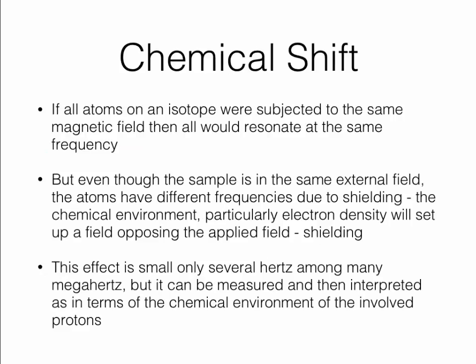So in the standard NMR experiment, if you think about it, at first glance, this is a useless technique. All of your isotopes are in one tube and it's stuck in the same magnet, shouldn't all protons resonate at exactly the same frequency? Shouldn't all carbon-13s resonate at their set frequency? If you think about that, then an NMR would just be a big isotope detector. Do I have protons or don't I? By seeing the frequency. But that's not the case because of a phenomenon called chemical shift.